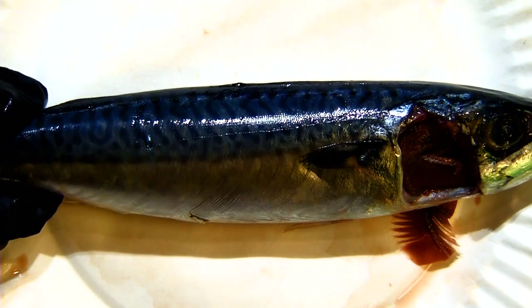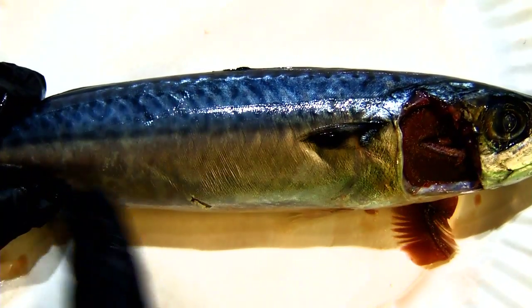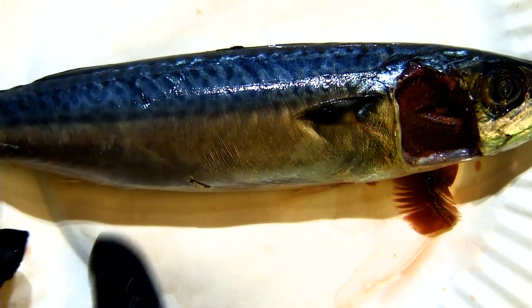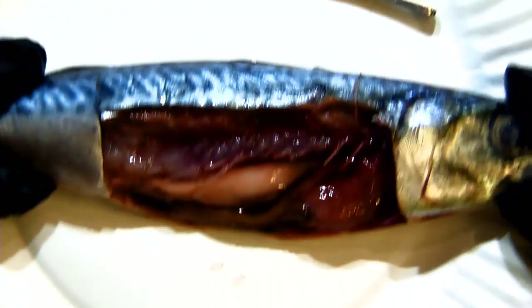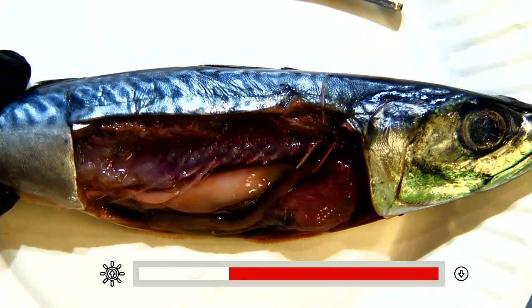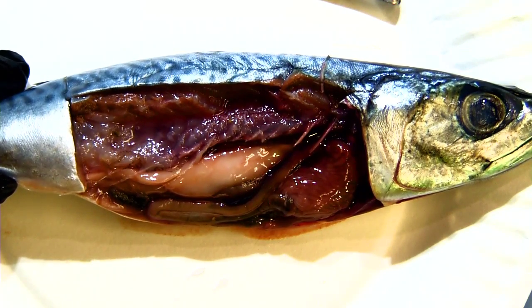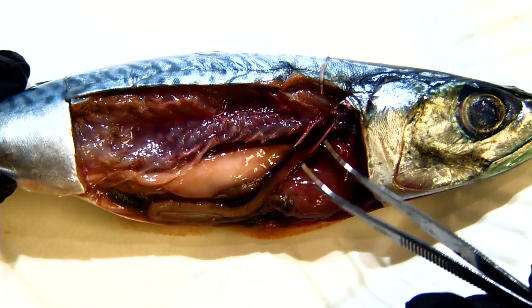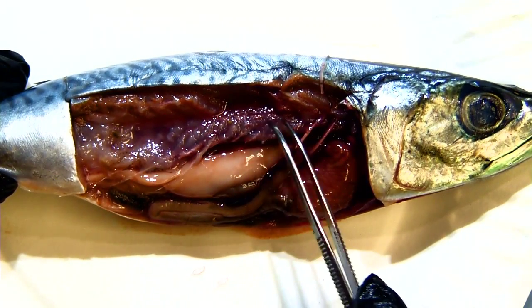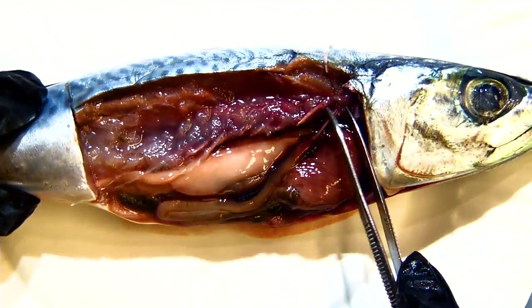We're going to cut from the cloaca forward through the pelvic fins up to where the gills are. An important thing about fish is that it is a vertebrate - they have vertebrae and bones, and they'll have ribs as well. Rather than cutting it all here, I have one prepared just before this class. You can see fish have really small, really fine rib bones right here that connect right up to their backbone, which would be up here at the top.